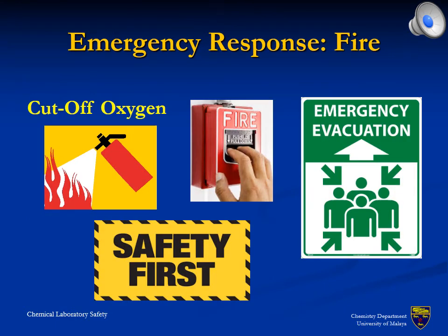Fire in a chemical laboratory should be addressed immediately, before the fire exceeds the size that can be handled by non-professionals. For any firefighting, however, personal safety is of highest importance. In case of doubts, it is recommended to flee rather than to fight.